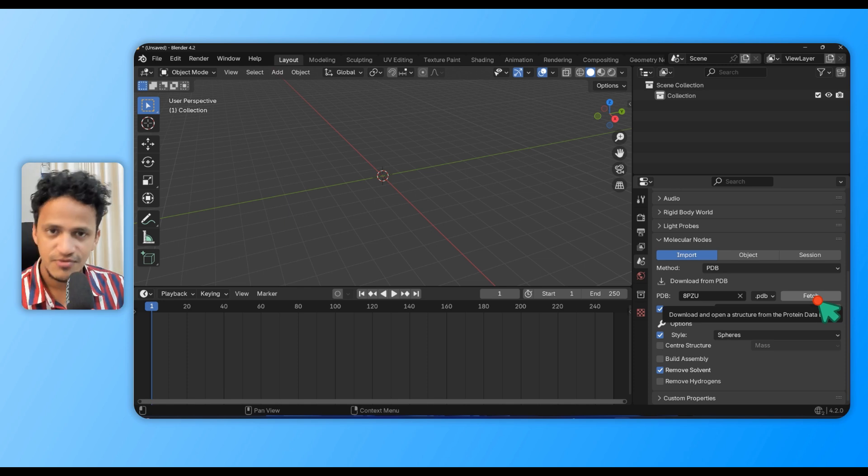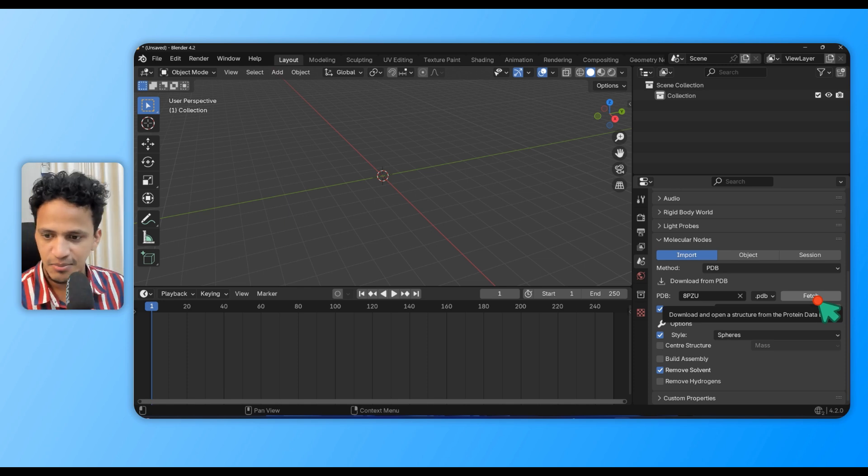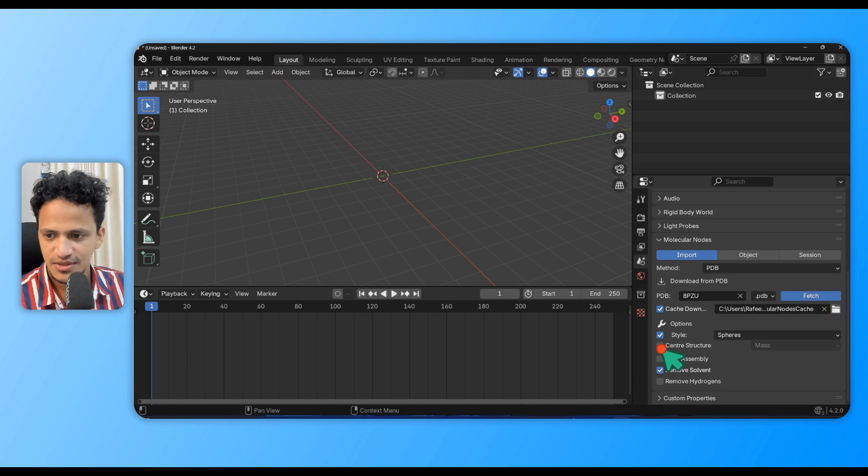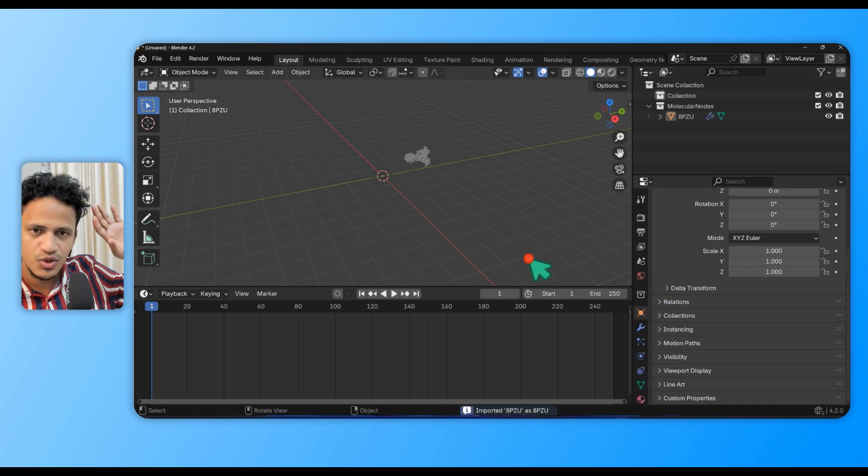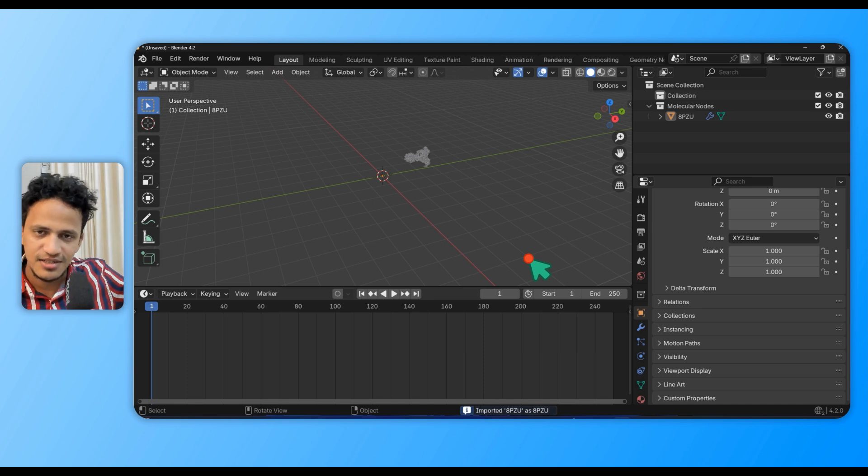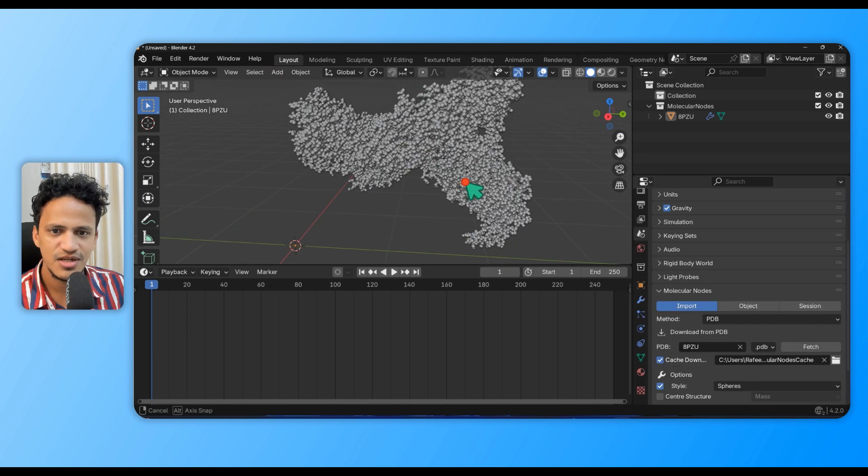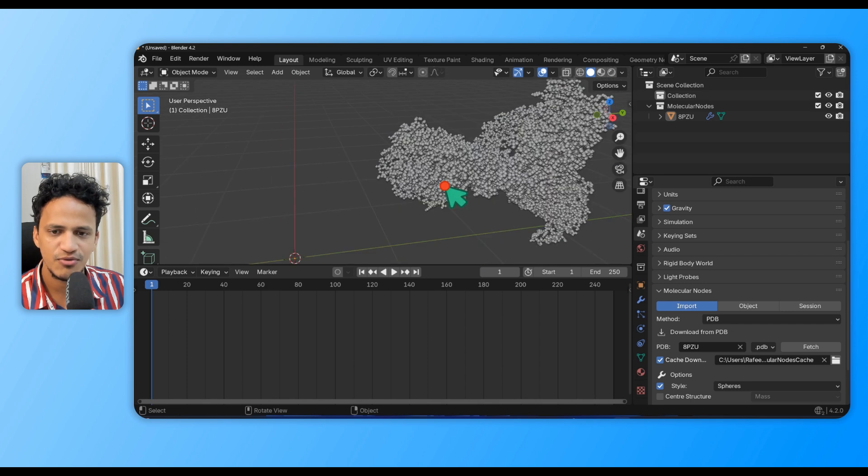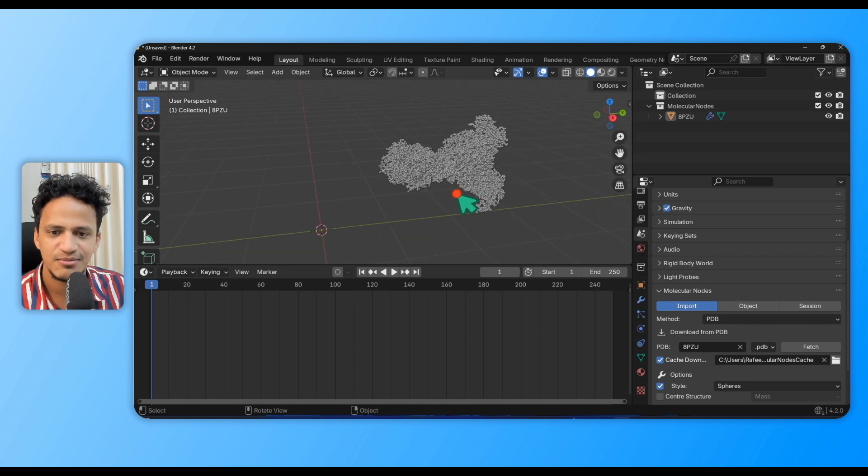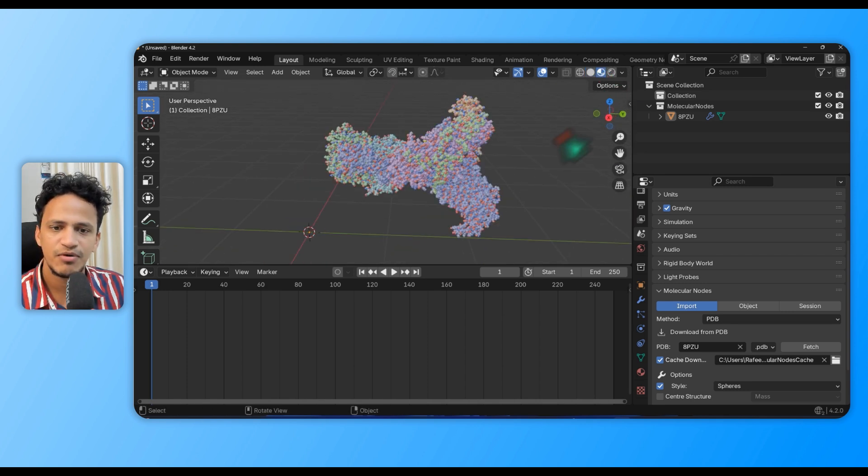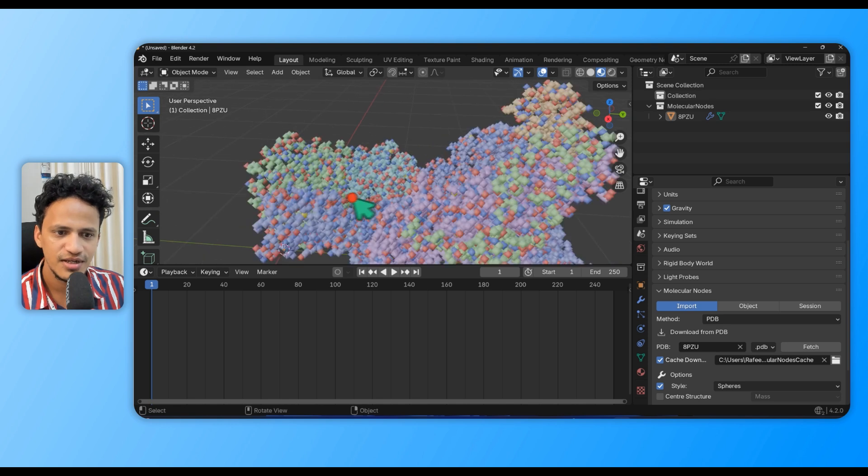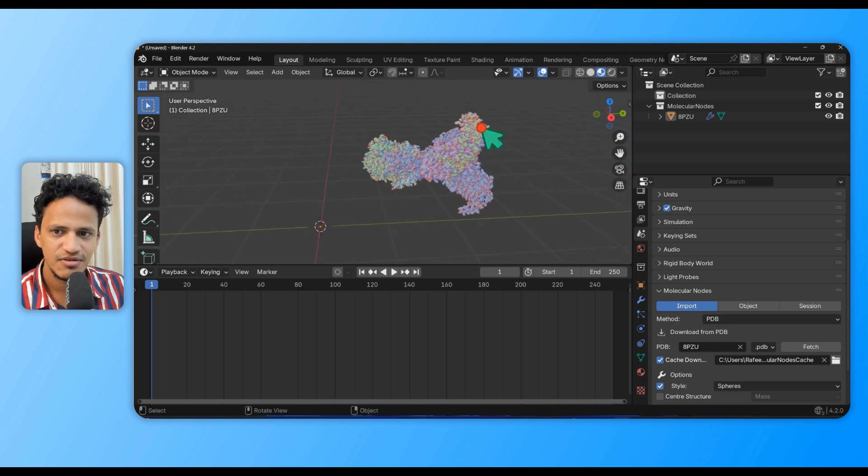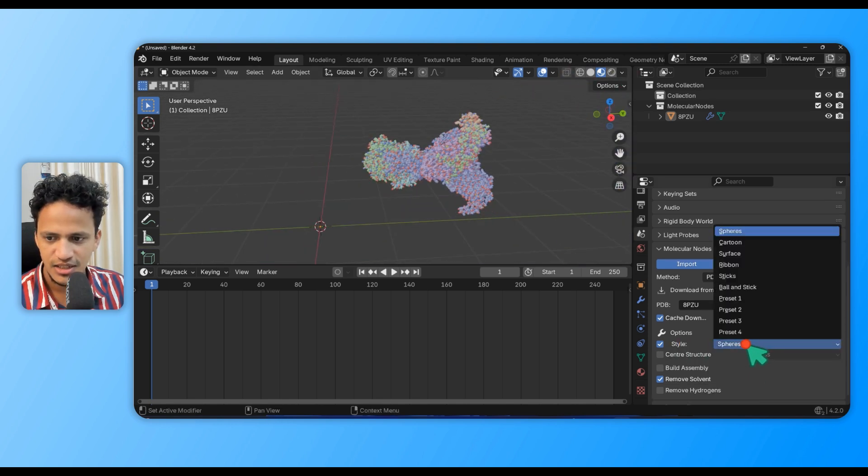You can see several other file formats we can download, but we will only proceed with this. We'll explore everything in detail in coming videos. Simply click Fetch. Blender is connecting to the Protein Data Bank database. Molecular Nodes has just downloaded different positions of all the atoms. Switch to material preview mode and you can see all the atoms in different colors.